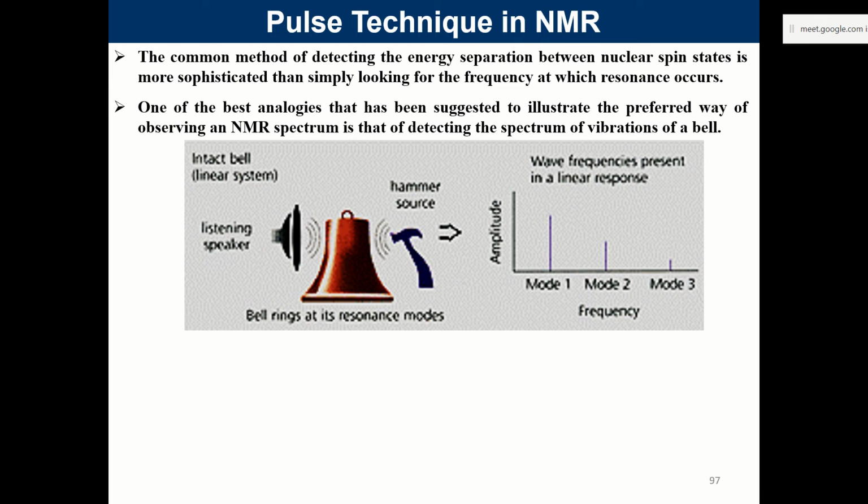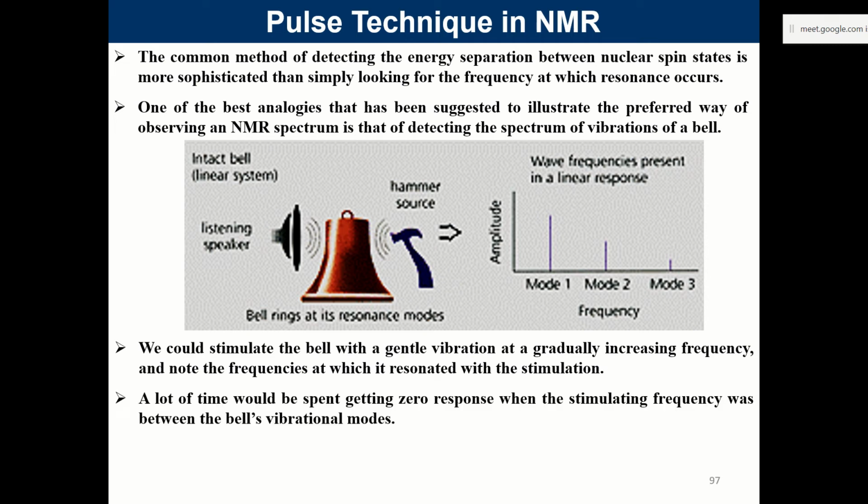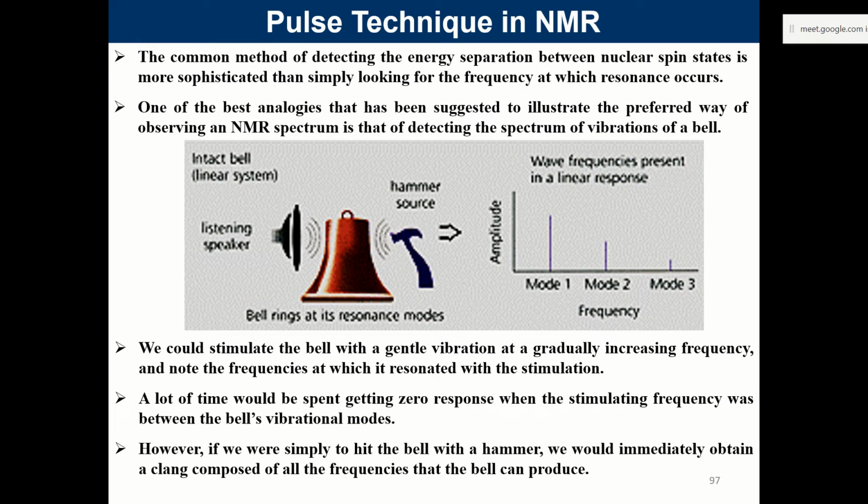That kind of thing is what we are going to do: a mixture of two, three waves at which the given species can oscillate with characteristic frequencies. So that is a pulse: a mixture of several different waves together, applied for a very short duration. This is what the example was, and we started off from here. I'll make the previous class lecture available on YouTube as well.